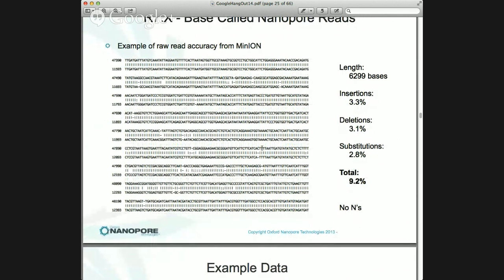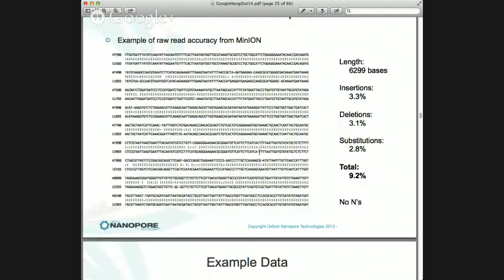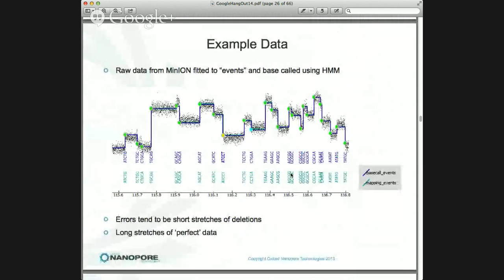But what I would emphasize is we have not hit the hard limit on data quality, for a reason I'm going to quickly move on to. This is just showing that pathfinding. So here is the algorithm finding k-mers through that block space.